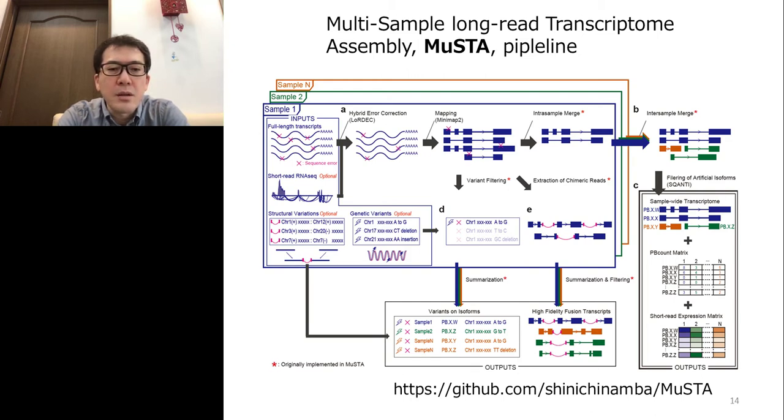By merging ISO-seq reads with similar sequences that were supposed to be derived from identical transcripts, we can obtain catalogs of non-redundant transcripts for individual samples, and they were further combined to generate a cohort-wide transcriptome, as shown in panel B.